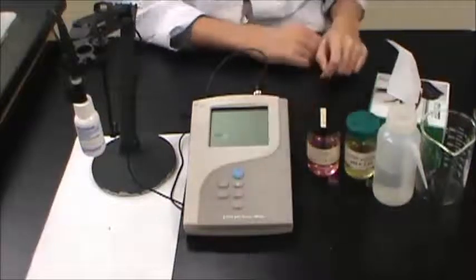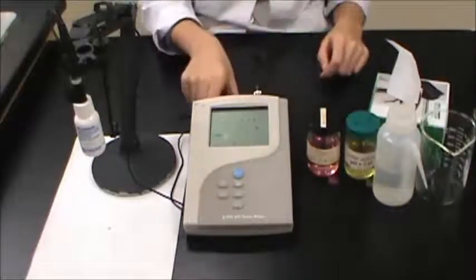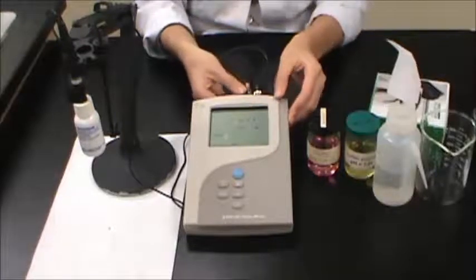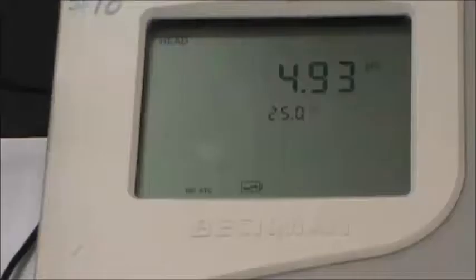Turn on the pH meter by pressing the on button at the bottom of the instrument. If the temperature probe is not connected to the instrument, plug it into the appropriate port at the back.